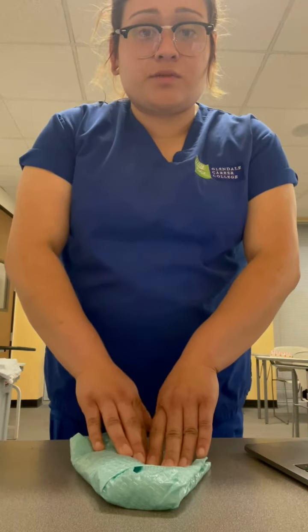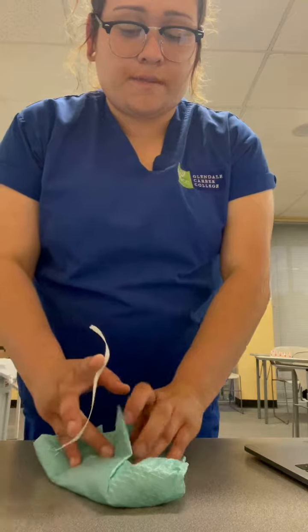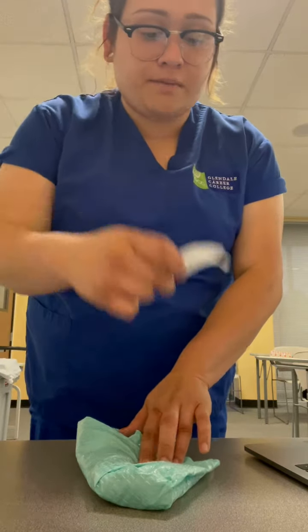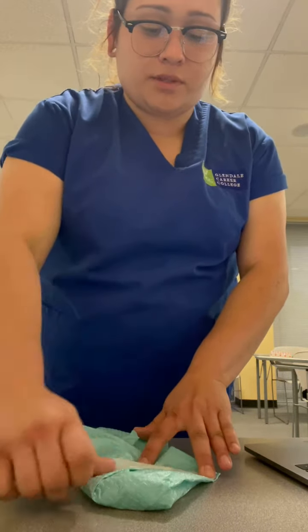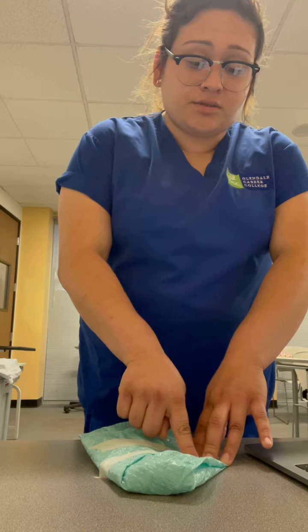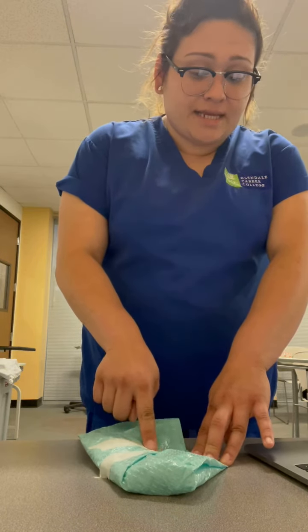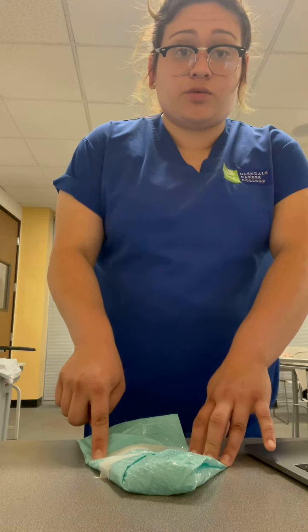Once the supplies are sealed, we want to make sure we tape it closed. Now, we are going to use our autoclave tape to tape it shut. Make sure we label it and write on the tape what the supplies are. So it's going to be Pap smear pack, the date, and our initials so we know who set it up.